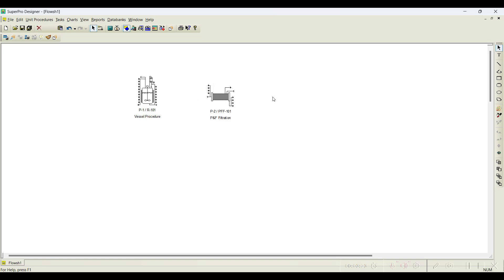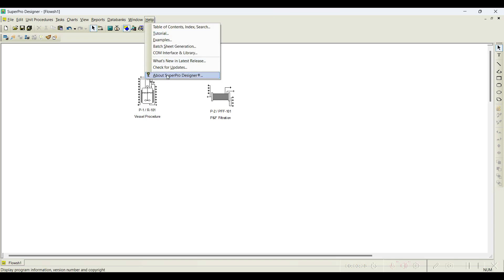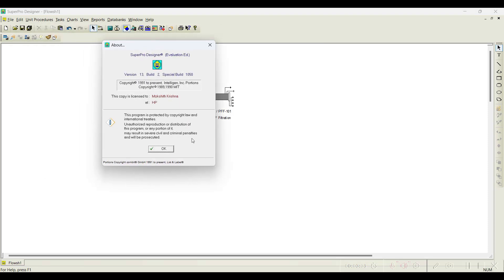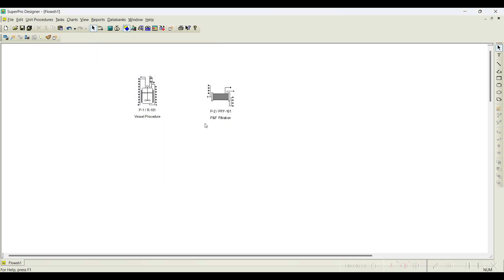Only two unit operations are required. I am using version 13 build 2, which is a trial version downloaded from the Intelligen website. In this trial version, you can only add two operations. That is the reason I have chosen this particular case study which involves only two unit procedures.